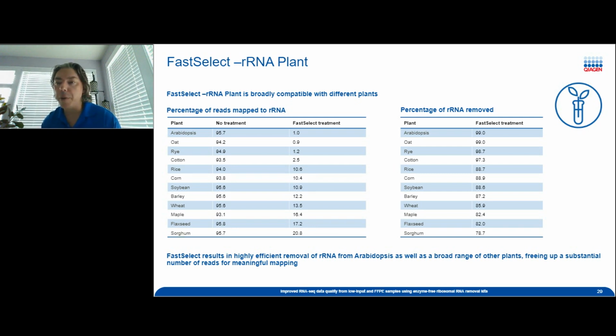In our handbooks, we also have a bunch of different tables. Regarding human, mouse, and rat, I can see some questions about whether it covers other species. We've tried it on cow, pig, and horses so far, and there are probably about a dozen other species that researchers have tried and published at this point.